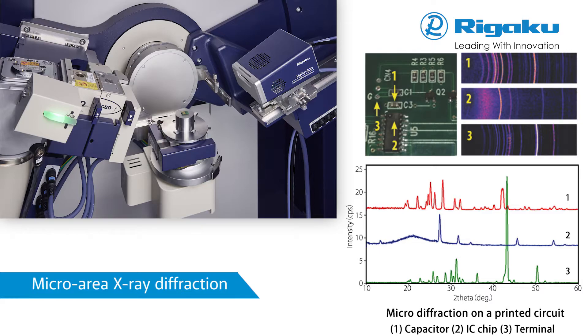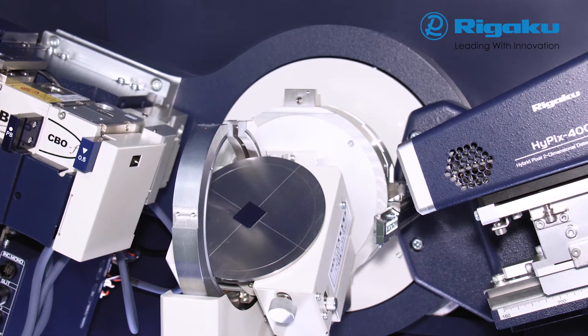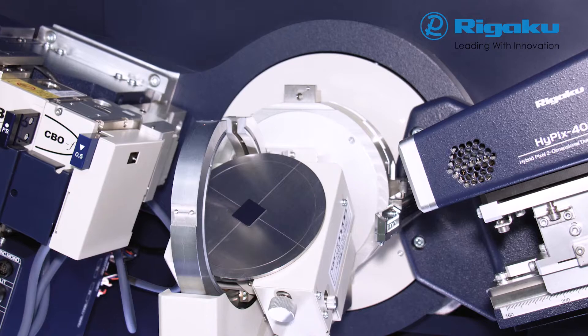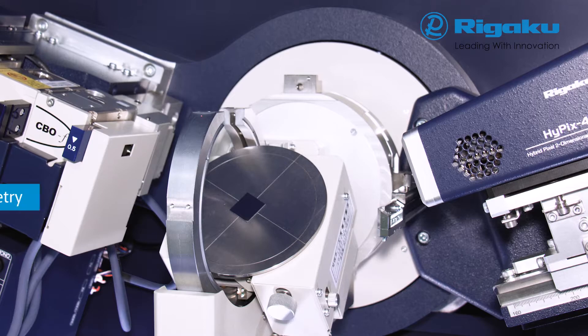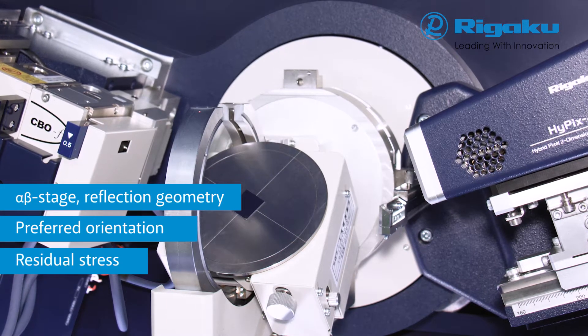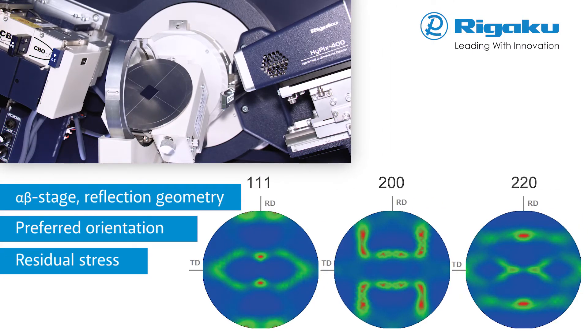A printed circuit board is used in this example. Pole figures reveal 3D preferred orientation of a sample, and residual stress measurement reveals any stress remaining on a sample after mechanical and/or thermal treatment. Such data is collected using the alpha-beta stage attachment. The Schultz slit for the pole figure measurement minimizes the defocus effect and enables correct measurement of intensity distribution along the tilt-chi axis. In this example, recalculated whole-pole figures of rolled aluminium sheet were based on measurement results with three different Miller indices.